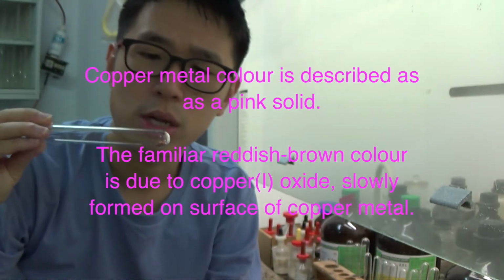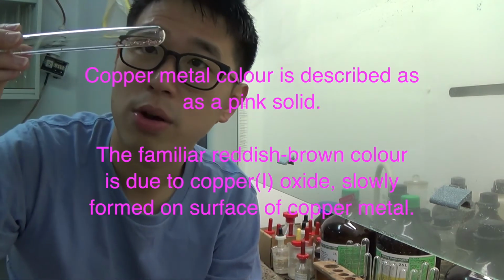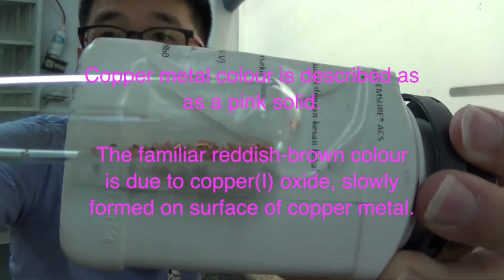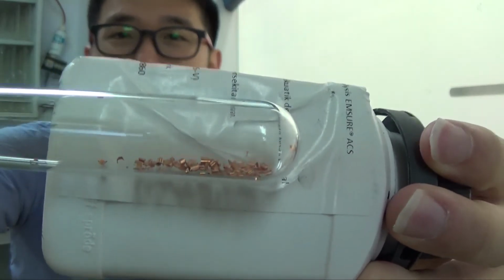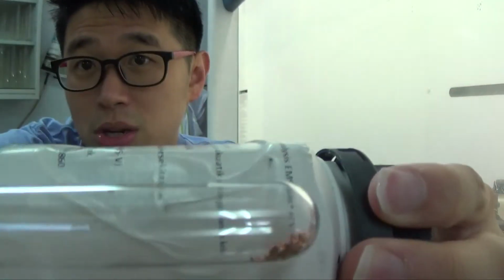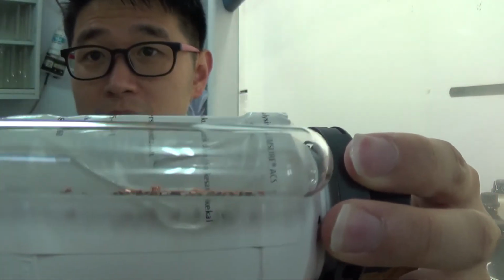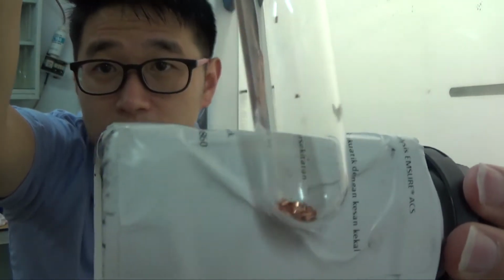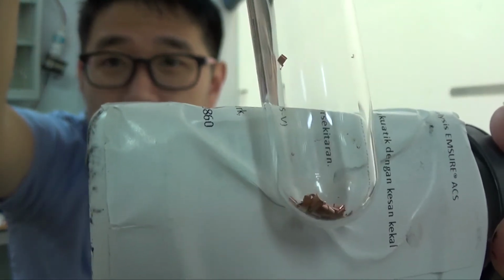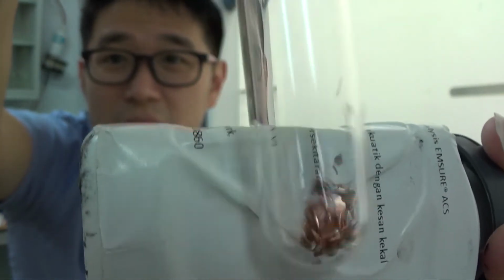A lot of books, a lot of marking schemes, a lot of exam centers somehow say that copper looks like a pink solid. Ideally speaking, I would probably recognize this as brown. It does look a bit pink depending on which angle you look at it. I think it's a perspective of light really. I'm not too sure how well it would translate in the video once it finishes processing, but that's how it looks. So a bit of brown, pink, not really orangey, right? It's kind of a bit shiny as well.